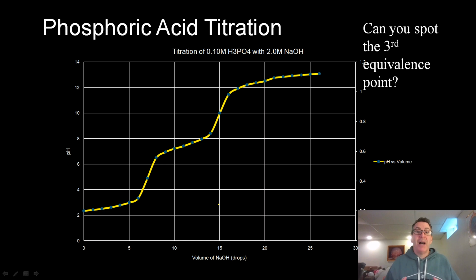I ended up trying to minimize the volume of the solution. I figured out that with a regular titration, the concentrations were just so dilute, especially when you used a relatively small concentration of base, that it was just a smooth line up here. And you can see it's pretty smooth in this case. But I want to show you a little bit of detail with that.